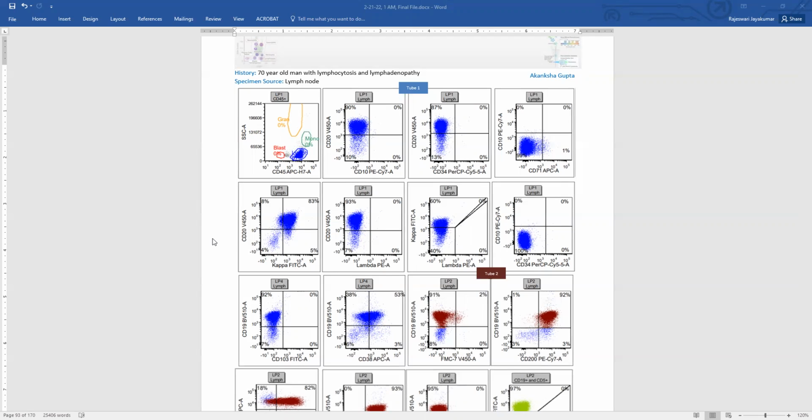So these are monoclonal. We cannot say that something is monoclonal by flow cytometry. We can say it is monotypic, but monoclonal cells are also monotypic, and they are usually restricted to one surface light chain. So here, this is kappa light chain restricted, and we can say that these are neoplastic. And again, here is a nice plot showing kappa and lambda on the B cells, and we see that these are kappa restricted. Normal B cells would express bright light chains, but here the light chain expression is dimmer. And again, these cells are negative for 10 and 34.